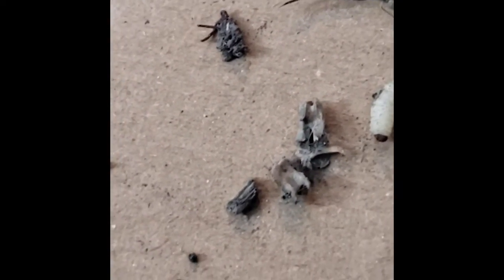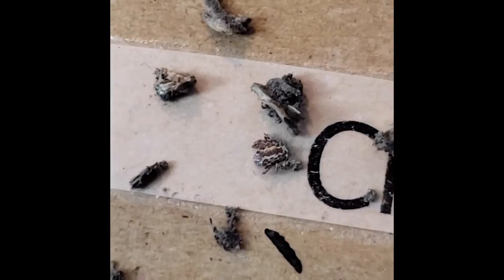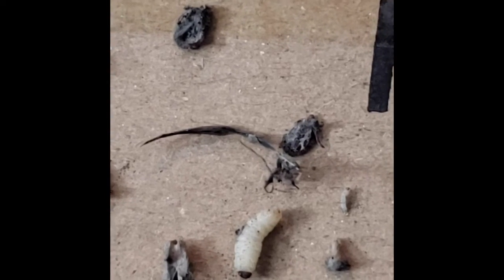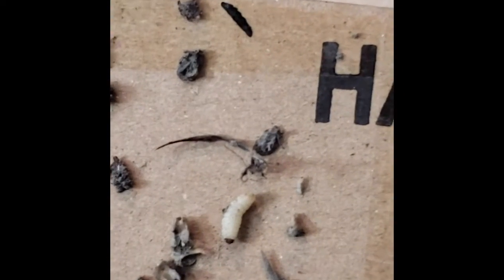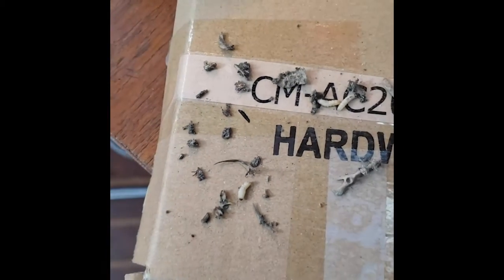Here we have what I've found. Here's some of the grubs. You can see some bone fragments there. Grubs, that's some sort of, I don't know what part of the body that is, but we're going to find out. That's a tooth right there. That's a tooth from a rodent of some sort. This feather was on the outside of the owl pellet, so it may be from the owl itself. What I'm going to do now is soak these, the bones at least, in 50% isopropyl rubbing alcohol to clean them up and see what else I can find about them.